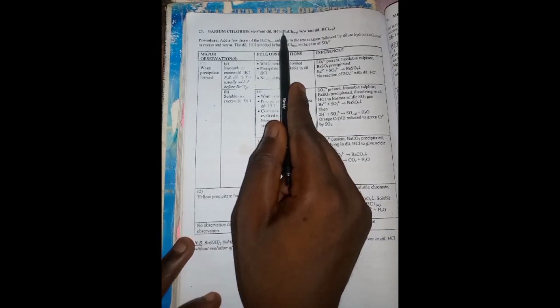You simply open to page 88, inorganic reactions. We open. So as you can see, guys, this is page 88 I have here. This is page 88, as you can see here. Then this is it, barium chloride with or without dilute HCl.